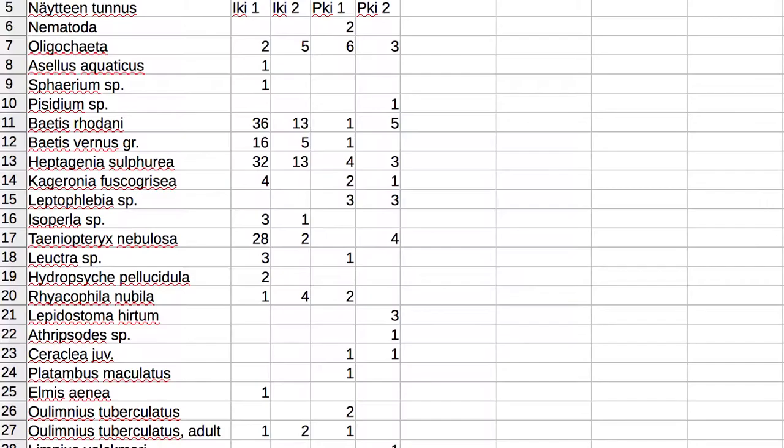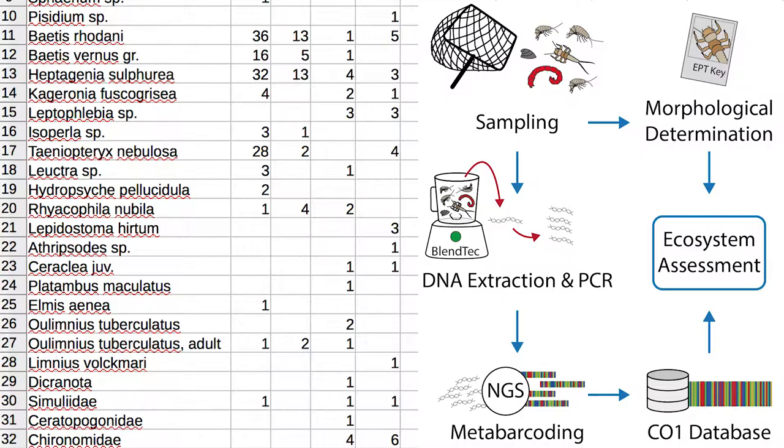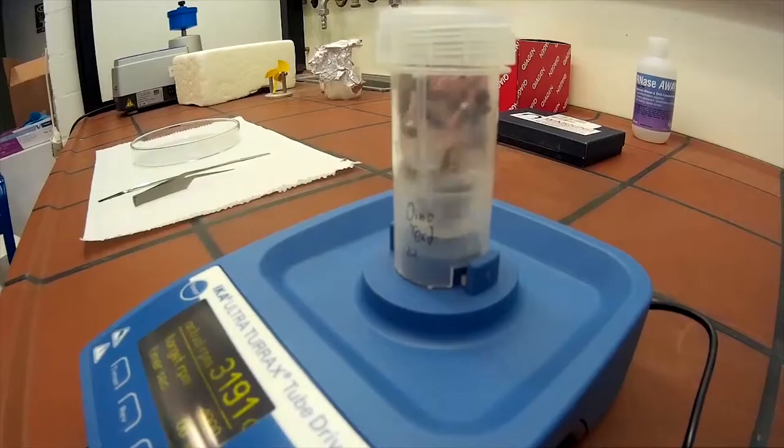All samples were identified based on morphology, and we are now going to extract the DNA and apply our metabarcoding protocols to identify the same samples with DNA barcoding techniques. This way we can compare performance of traditional morphology-based identification versus DNA-based metabarcoding methods.